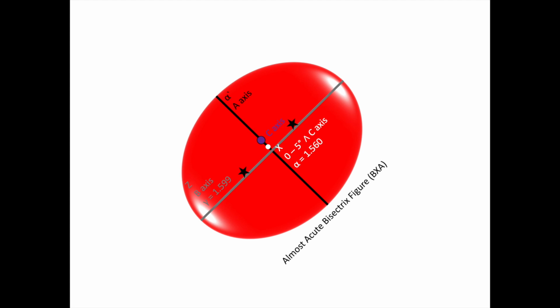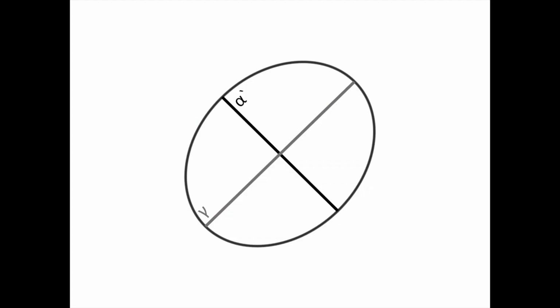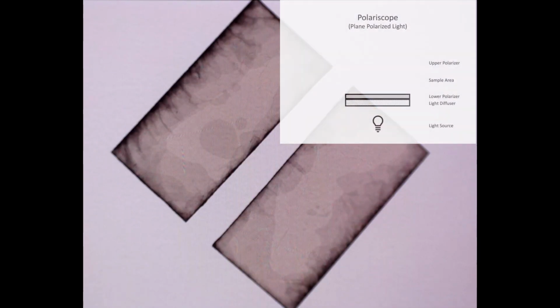And while our optical indicatrix is a 3-dimensional representation of our refractive indices of our substance, if we're only taking one view through a substance, all we have to think about is a plane. In the case of our muscovite plates, the gamma alpha prime plane. With this knowledge, if we return to a view of our oriented muscovite plates in plane polarized light, we can think about how our plane polarized light is going to interact with our muscovite plates.